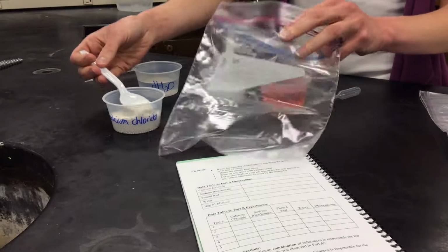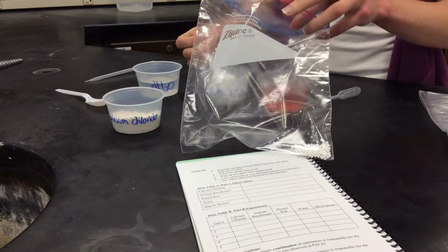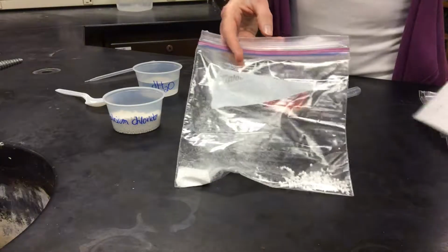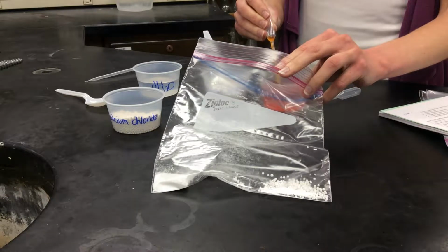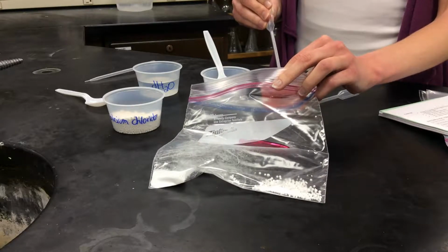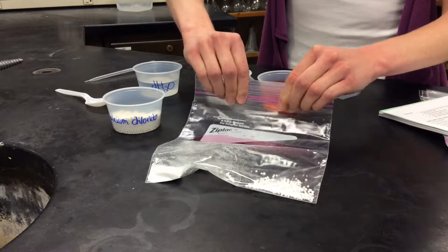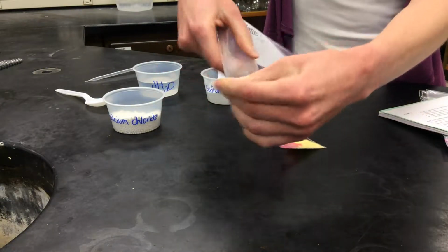Alright, so I'm putting in the calcium chloride. It's all going to go down in one corner. And I've got sodium bicarbonate. I'm putting in the other corner. Trying to keep them separated for the time being. And now I'm going to add phenol red just into the middle of the bag. Alright, and I'm going to zip up the bag, and then I'm just going to let these 3 things mix together. And then you need to write down your observations.